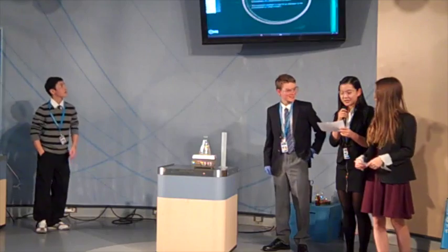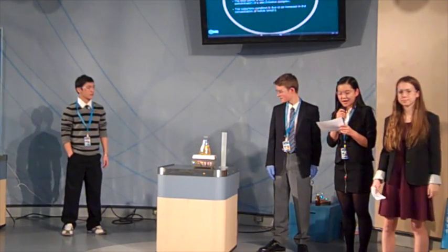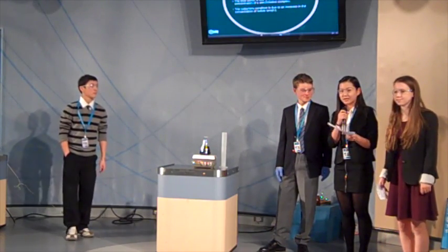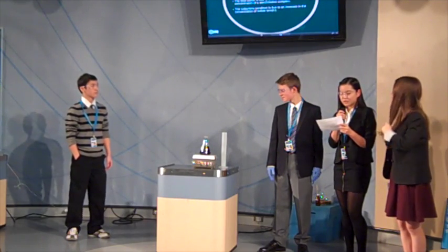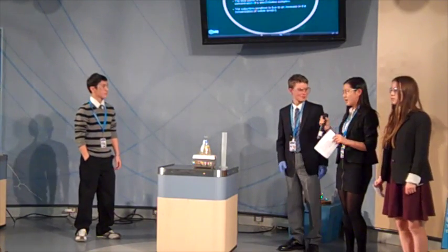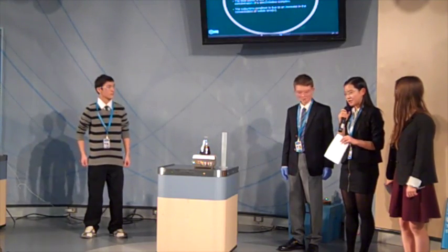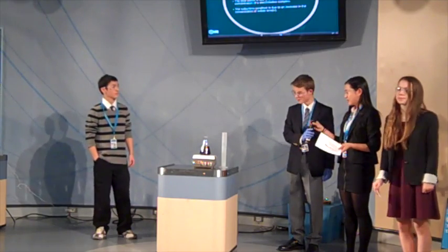So eventually the increase in iodide ions leads to a colorless solution. Then the iodide ions once again react with hypoiodous acid to form iodine, and the cycle begins again. Once the original reactants are depleted, the oscillations will stop and reach a steady state where pentaiodide ions dominate, creating the blue color. And just to say that we don't know exactly why this reaction is occurring. It's still unknown to scientists.